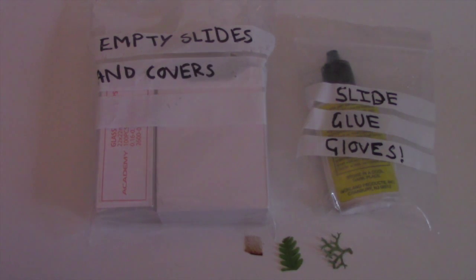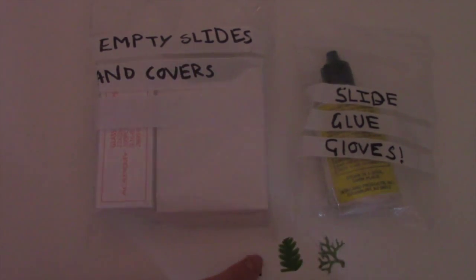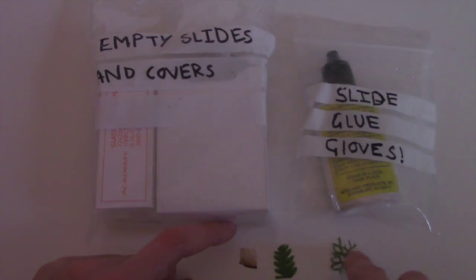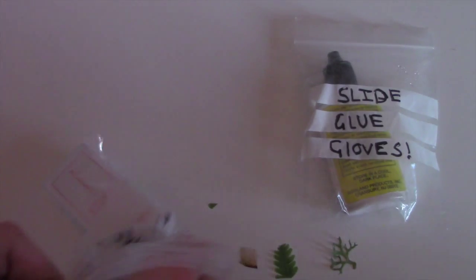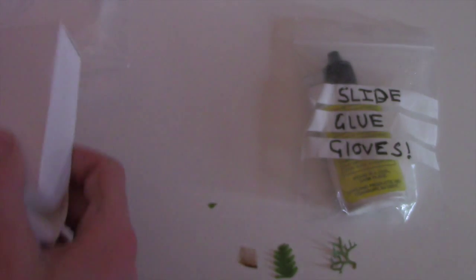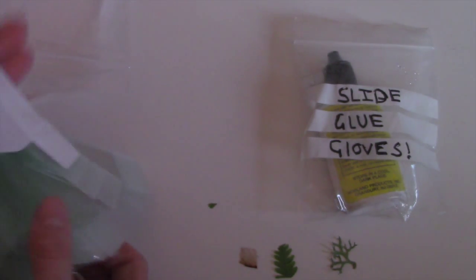Back from the woods, here are the things we collected: a little bit of a sycamore seed, a fern, and a piece of algae. We're now going to prepare the slides. I've got the empty slides and covers — let me open this bag and get the slides out.